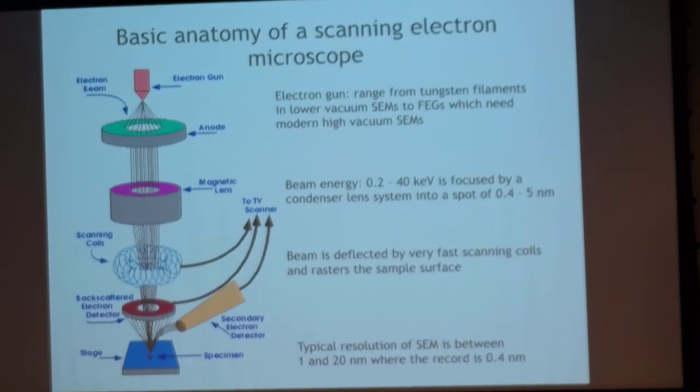You can do all sorts of things, looking at things that produce more secondary electrons, which means that you have different elements in there. But as far as the configuration, there is no such thing as a projection system here, because you don't actually do that. You're not really working at different magnifications. Okay.